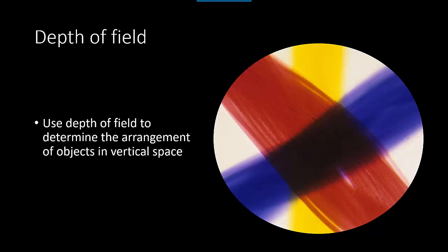Exploring the depth of field allows you to determine the arrangement of objects in vertical space. Using the fine focus, you can determine the order that the objects come into focus. You'll be looking at a slide similar to the one shown here.